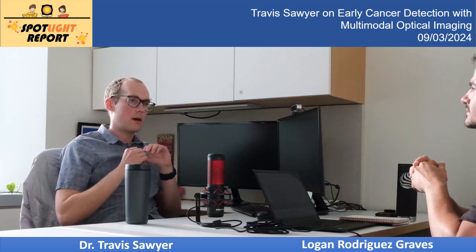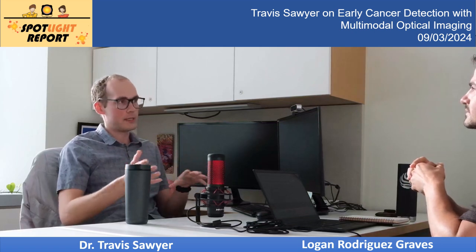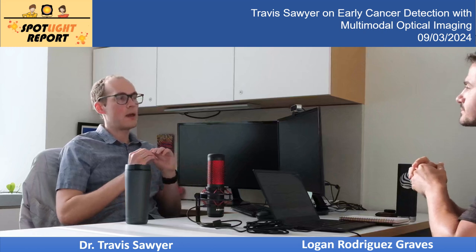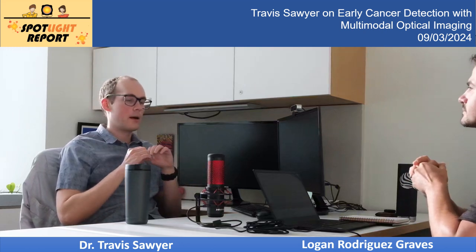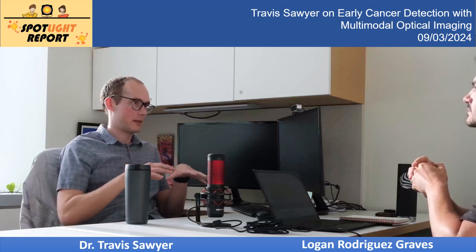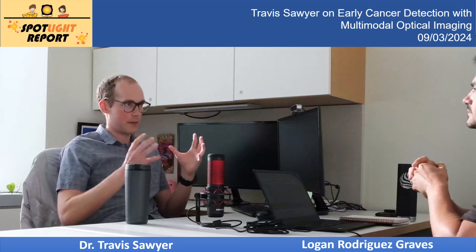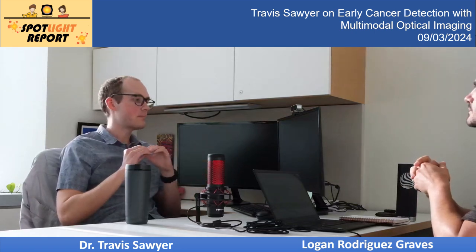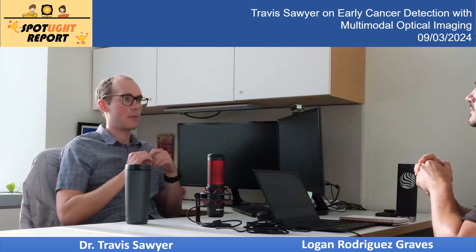For multiphoton, that's more of a label-free technique in terms of what I was doing. And so that's looking at those natural metabolic markers or... That is the main one, metabolic, but I am interested in some other ones. Like there's certain ones that are indicative of senescence in cells, which is when they go into a dormant state. But in my dissertation work, I think it was mostly looking at the metabolic factors.